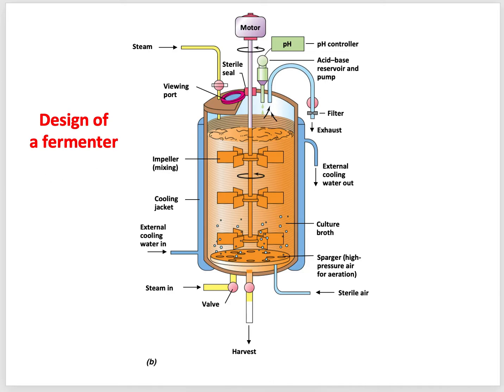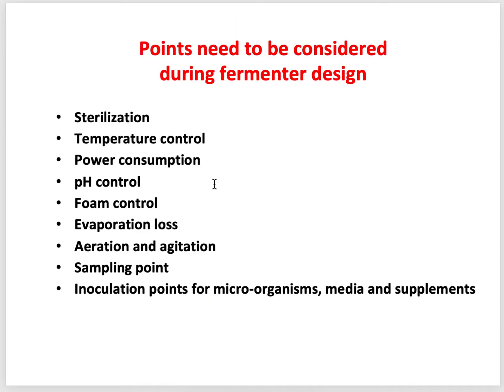Anyway, when you need to design a fermenter, you have to consider several points such as sterilization. I mean, how we are going to sterilize our fermenter. Before running, the fermenter needs to be prepared, and in that step we clean the fermenter and sterilize it.